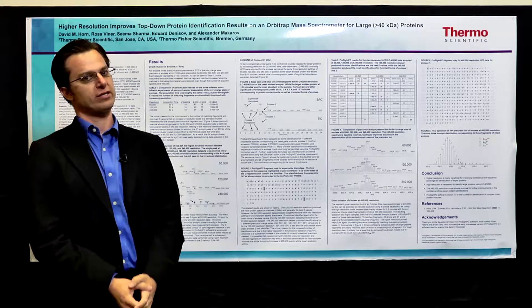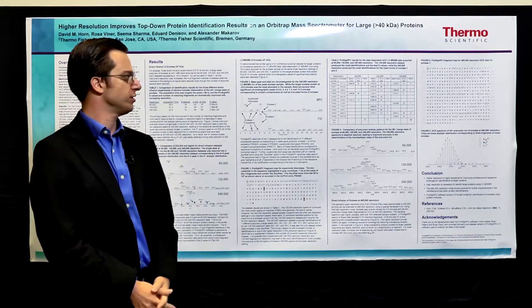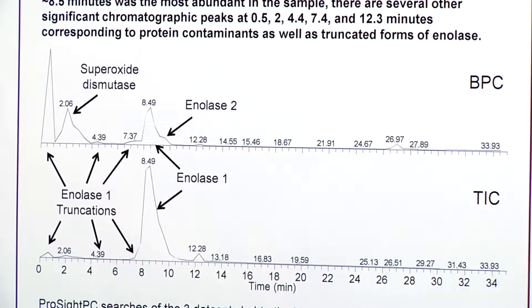And what we were surprised to find, or maybe not quite so surprised to find, was this was supposed to be a single protein enolase, 47 kilodaltons, and from our chromatograms here, from the base peak chromatogram and the total ion chromatogram, there was clearly several different species of proteins in the chromatogram.